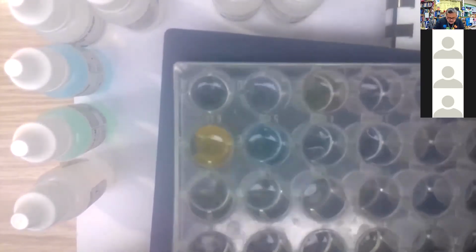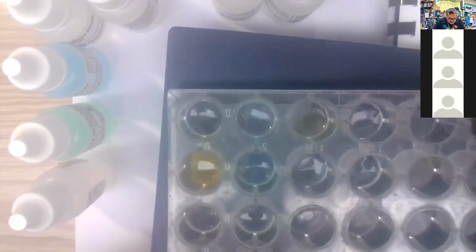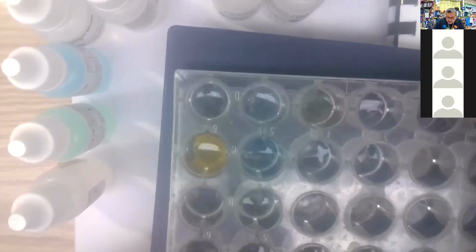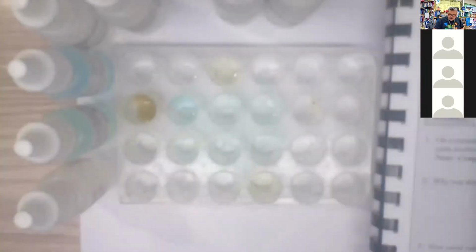And then over here, this looks dirty, but you could see some coloration of the plastic. I ran this through the dishwasher a couple times, so that's the best we're going to get. All right, so that's the second column, with the potassium hydroxide.